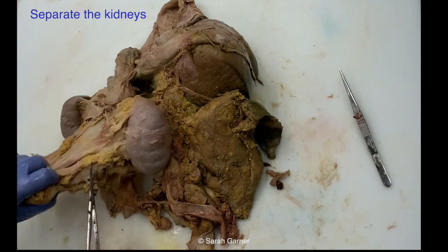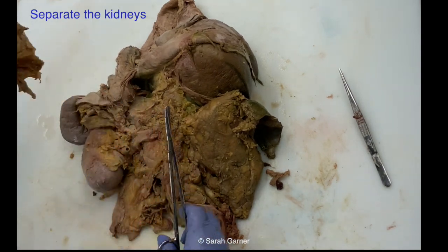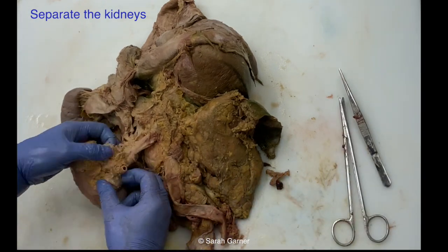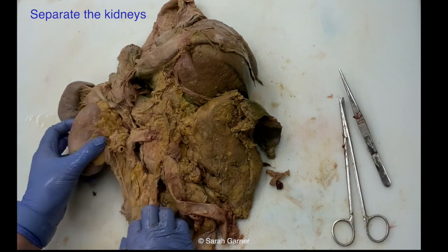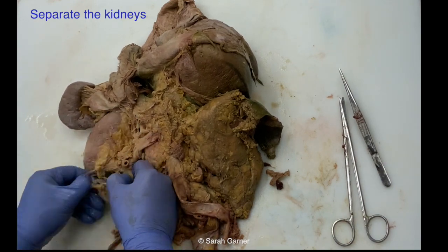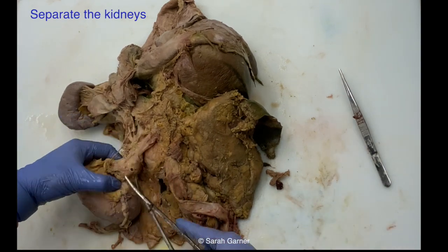And then you know that we don't need this anymore. So we'll go ahead and trim off this excess fat, okay? We have our kidney here. Obviously, we're going to have to clean it up a little bit more, but that at least gives you the general structure so that you can see what you're working with, and it gives you that anchor, okay? So go ahead, cut this.